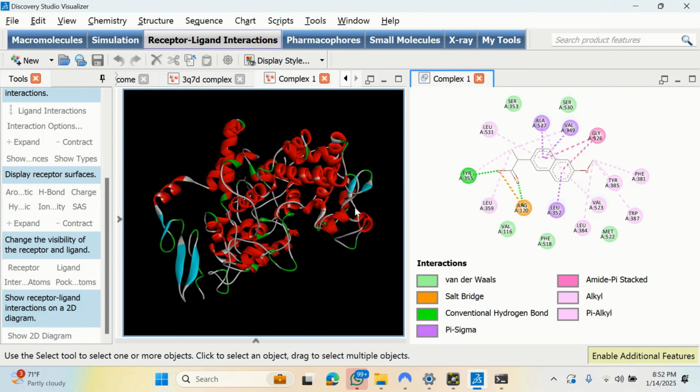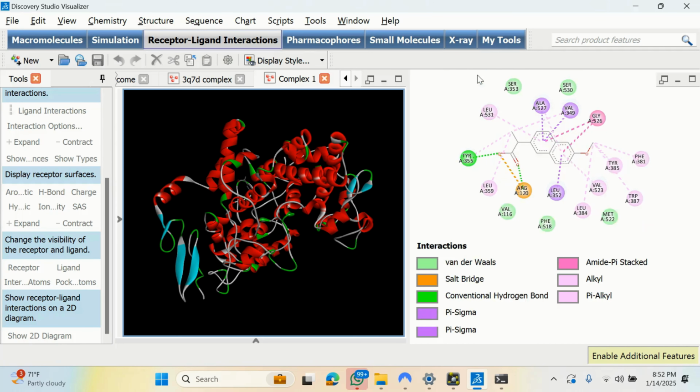All right, so as you can see, this is the same ligand which I have docked into the same pocket of that protein, targeting arginine 120 and tyrosine 355. Of course, you can see that implicated here. This is the ligand-protein interaction. This is the 2D view, revealing the different active site residues here. So as you can see, this is arginine 120 and this is 355. So it's present in the first pose. All right, let's check the second pose.